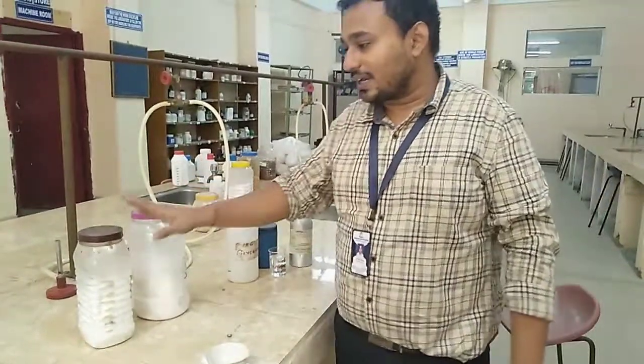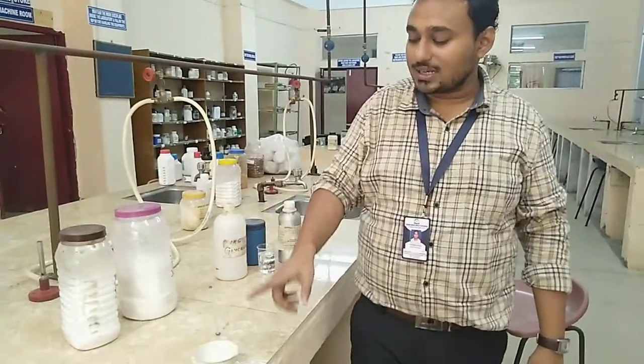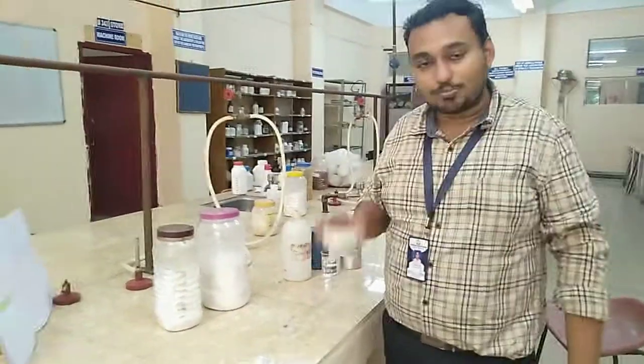The procedure is: stearic acid and lanolin are first mixed together in a porcelain dish, and we heat it up to a temperature of 70 degrees Celsius, mixing it properly.